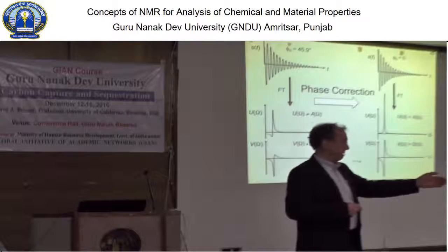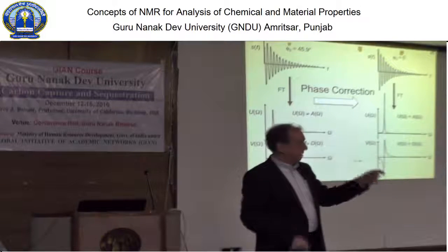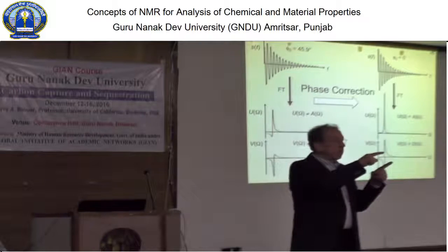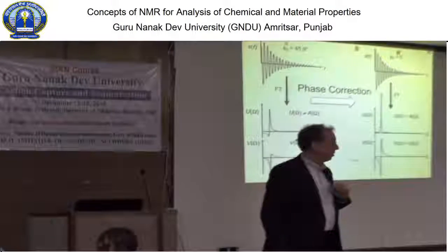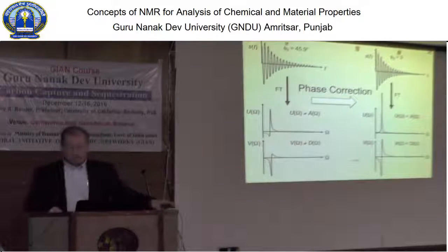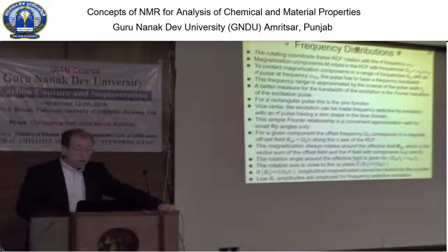The frequency-dependent part, proportional to frequency, is really something that derives directly from the dead time. And the constant term derives from the time it takes for the signal to walk half. So these are two origins of this phase term. Okay.